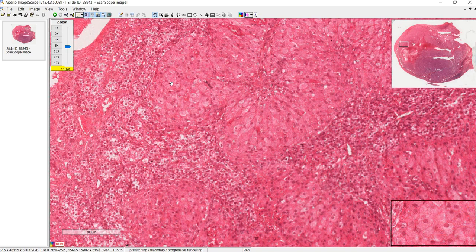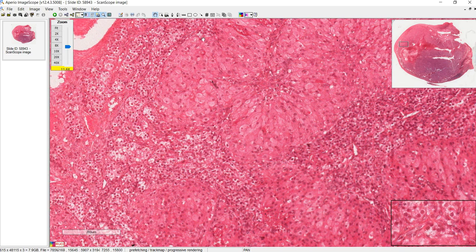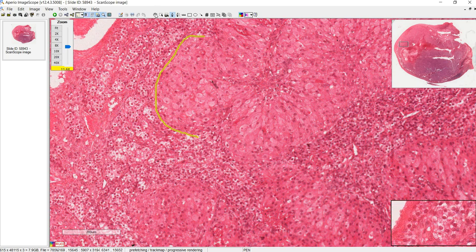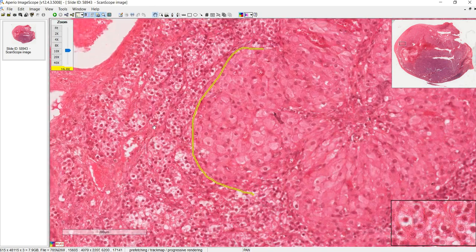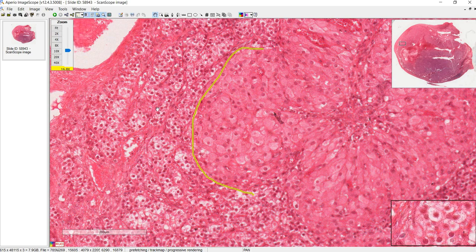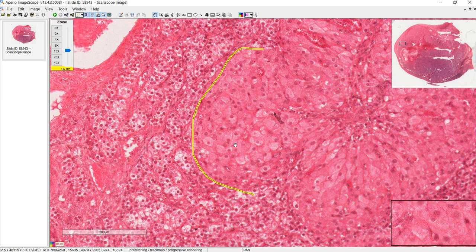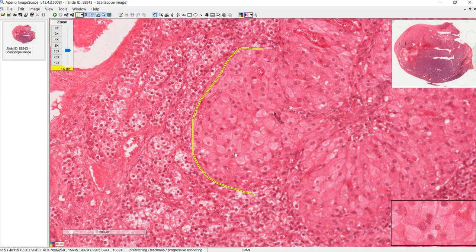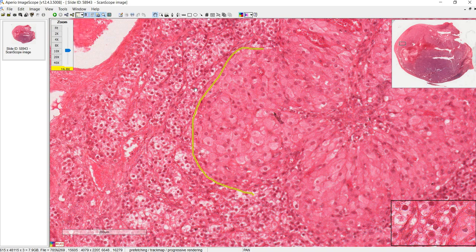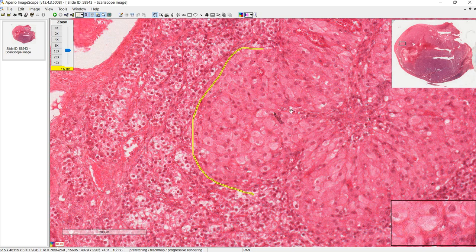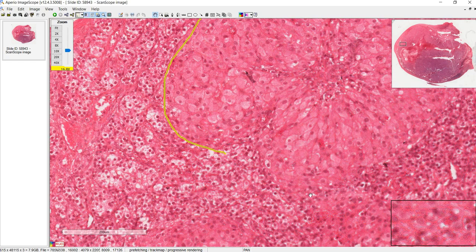Everything is somewhat mixed together now, but you can still see separation between the theca luteum cells and the granulosa luteum cells. The theca luteum cells have less cytoplasm and are smaller in general, whereas the granulosa luteum cells are larger. Previously in the secondary follicle, theca cells were vascularized but granulosa cells were not — now that the basement membrane is gone, capillaries can invade into the granulosa luteum cells as well.